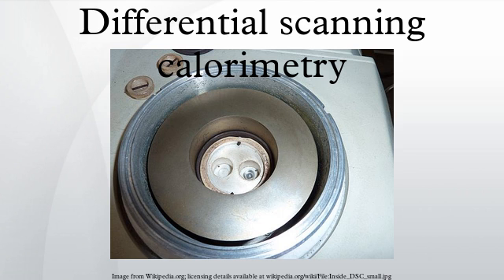Liquid crystals. DSC is used in the study of liquid crystals. As some forms of matter go from solid to liquid, they go through a third state, which displays properties of both phases. This anisotropic liquid is known as a liquid crystalline or mesomorphous state. Using DSC, it is possible to observe the small energy changes that occur as matter transitions from a solid to a liquid crystal and from a liquid crystal to an isotropic liquid.